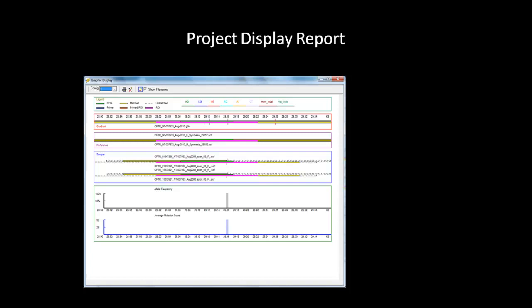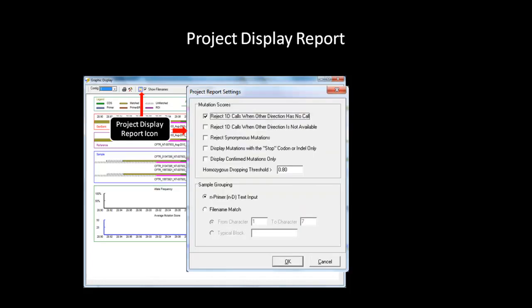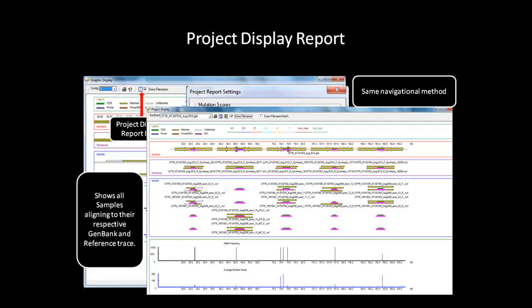The next thing we will talk about is the project display report option within the graphic display report, which can show all the samples, reference, and context in one window. However, unlike the project reviewer, it does not have an overlaying view of all the amplicons. It can be accessed through the project display report button, which will bring up a dialog box with settings. Reject 1D calls when other direction has no call is set as default because if a mutation is called in both directions, it is more likely to be true than if it is only called in one direction. After selecting the desired settings, click OK and the project display report will populate. This report is interactive and displays both forward and reverse samples, reference and GenBank information, allele frequency, and average mutation score for the entire project. This report can be printed or exported as a text, Excel, or XML file after reviewing the data.